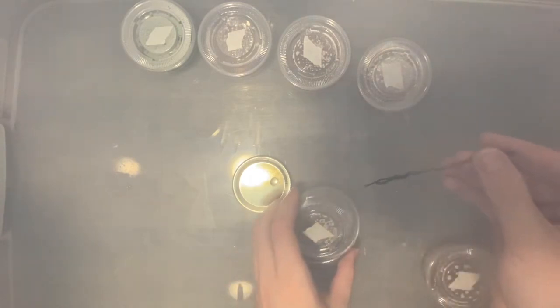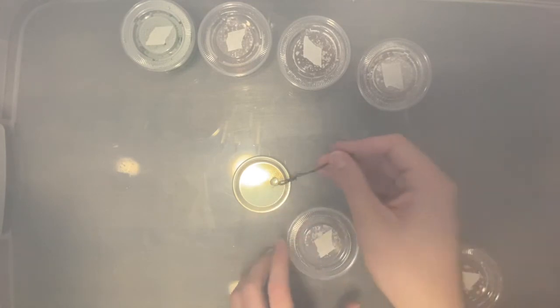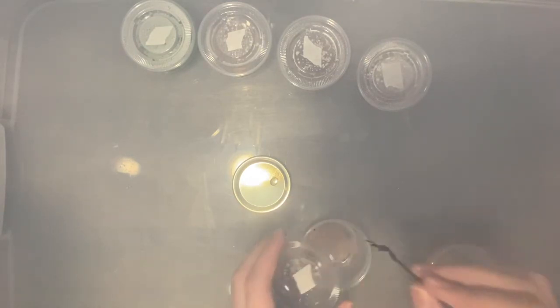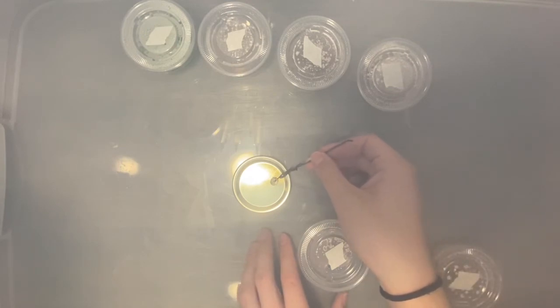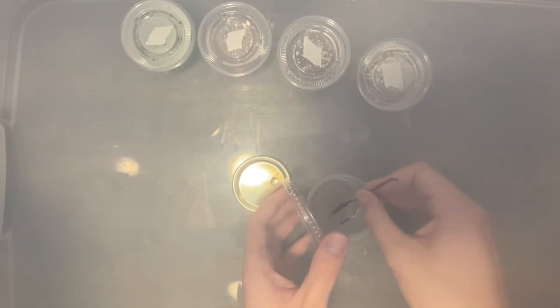All right, and then drag it across the agar. It's called streaking, just like that. And we're gonna do it one more time on the other side of the agar. So I'm going to flame sterilize. Now we're gonna streak it again.